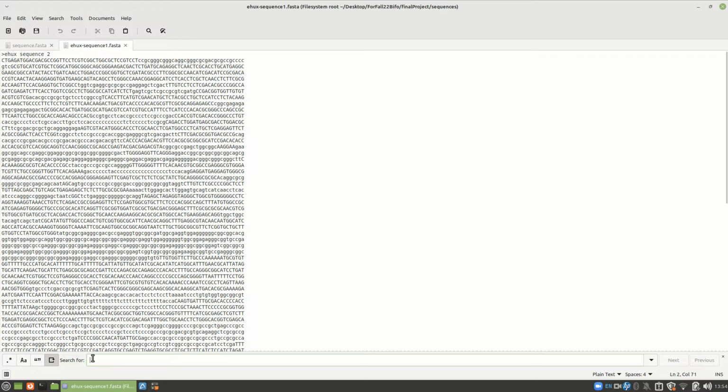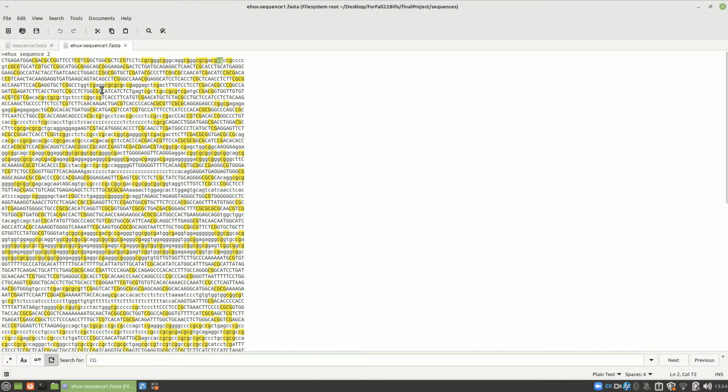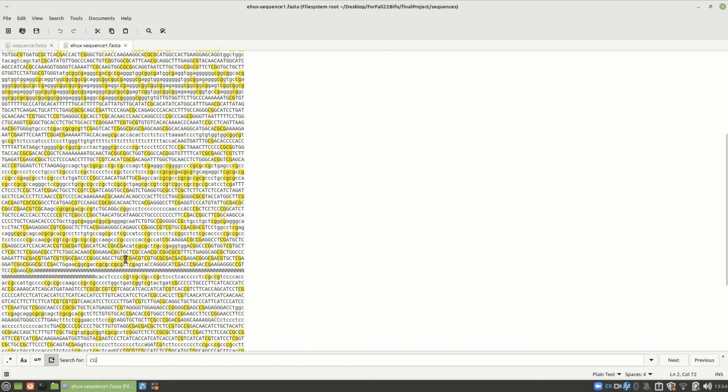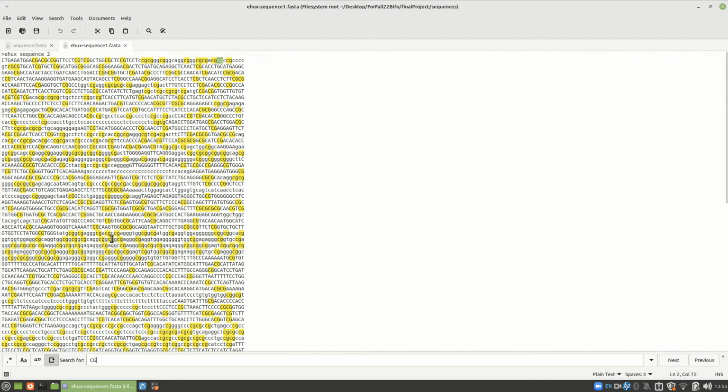So what do we do? Well, of course, let's search for Cs and Gs. Oh, man. Now, we're assuming this is genomic, and it is in the DNA, so you would search for Cs and Gs. This isn't good, and this repetitive sequence is probably wrong. They probably should have put Ns. There's no way that this is something that's legitimate, probably. So you can see that this is bad sequence. They know this is bad sequence, and they put that in, so there are Ns there. So with this being bad genomic sequence, this is not a good measure, just C followed by G.